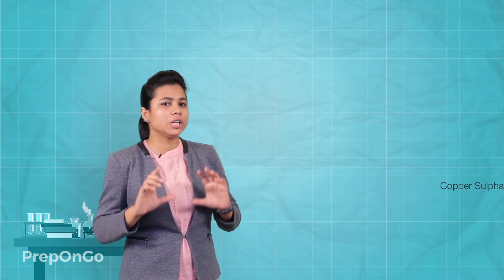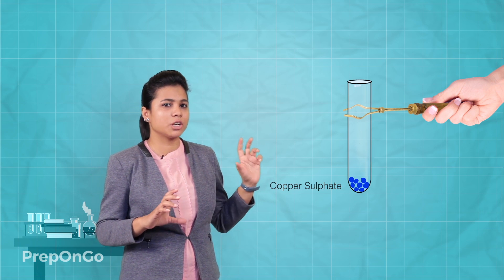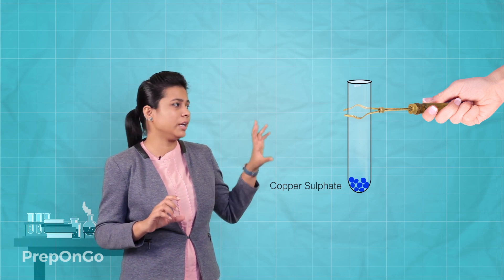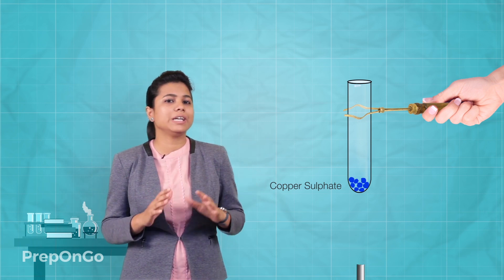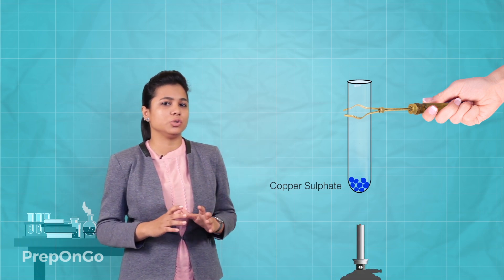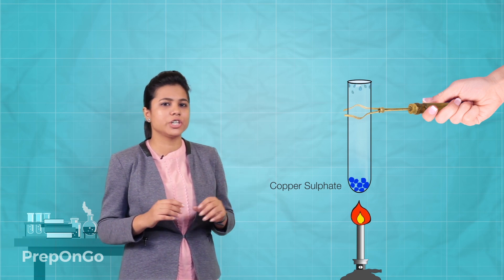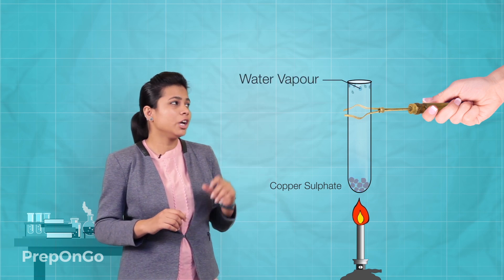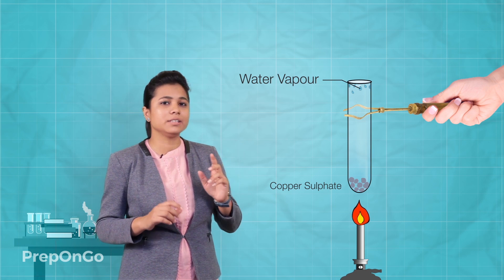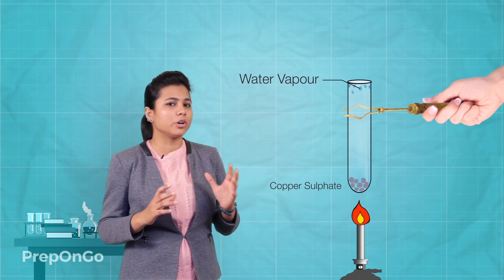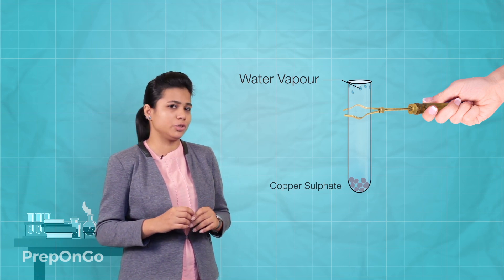Now we are going to perform an activity — perhaps the last activity of this chapter. We are going to take some copper sulphate crystals, which are blue in color, in a test tube. Now we are going to heat this test tube. You can see that the crystals have changed color to colorless, and there are some water vapors at the mouth of the test tube.